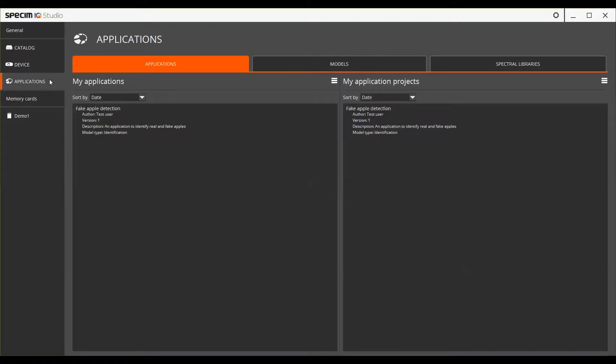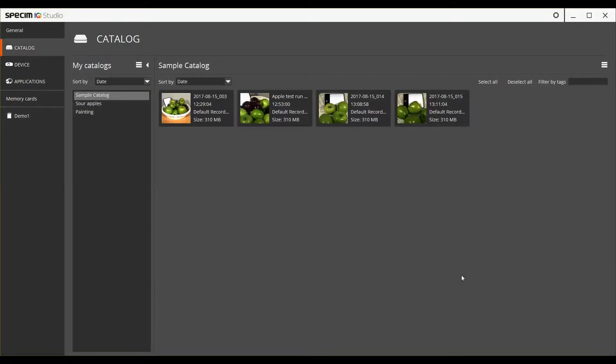Below these functions you will also see the memory cards and card readers attached to your computer. The Catalog is a place where you can store, manage and research the recorded data.